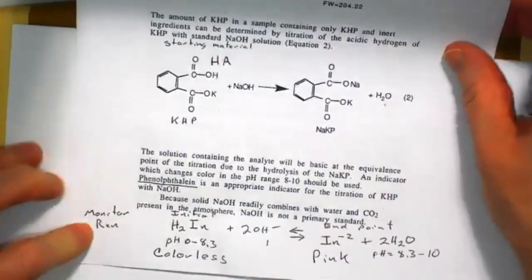So I like to draw pictures. So let me draw a picture of that. So the KHP. Trying to get this all lined up. I've got monitors on down here too to watch.